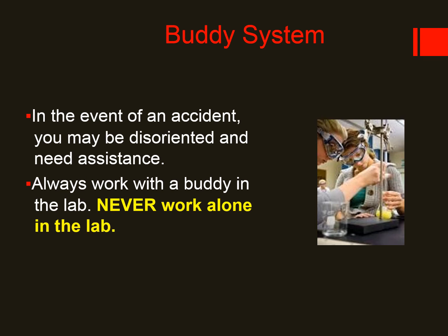And the buddy system. The buddy system is very useful because it is not allowed to work inside the lab alone. In case of emergency, imagine you face some accident and no one is there, and then the following day you are found unconscious or dead. Nobody knows, right? So it is better to have the buddy system. It is always recommended never to work alone inside the lab.